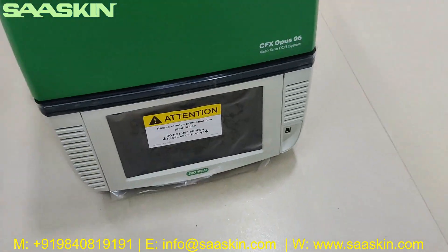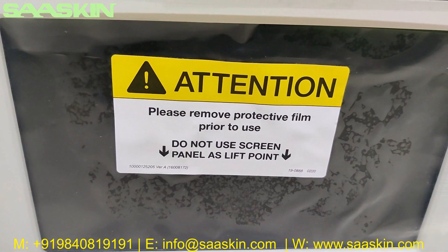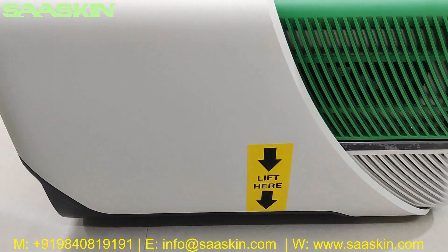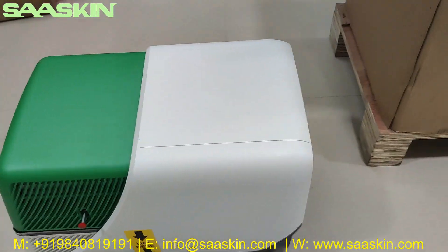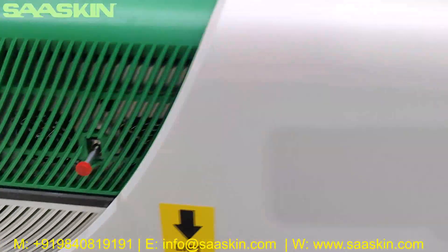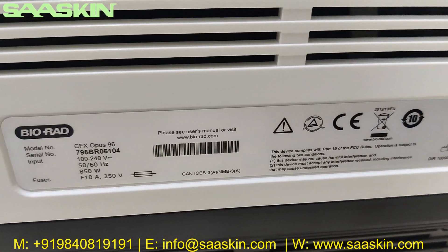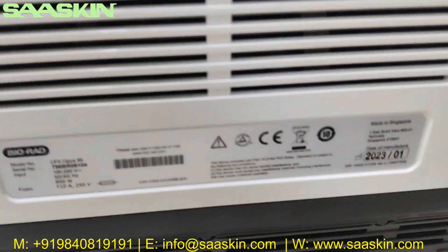You can see this is the CFX Opus 96 real-time PCR system. There is a note on it saying 'please remove the protective film.' Looking at the sides and the back, you can see the machine details and power specifications on the back panel.